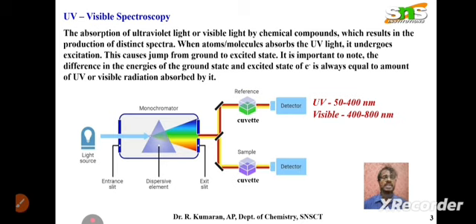So it is very clear that it deals with the excitation of electrons. Generally each and every atom or molecule deals with that. Based on that, the presence of those atoms or molecules, and in what state, would be analyzed mainly through the excitation of electrons. It happens when the energy is absorbed.